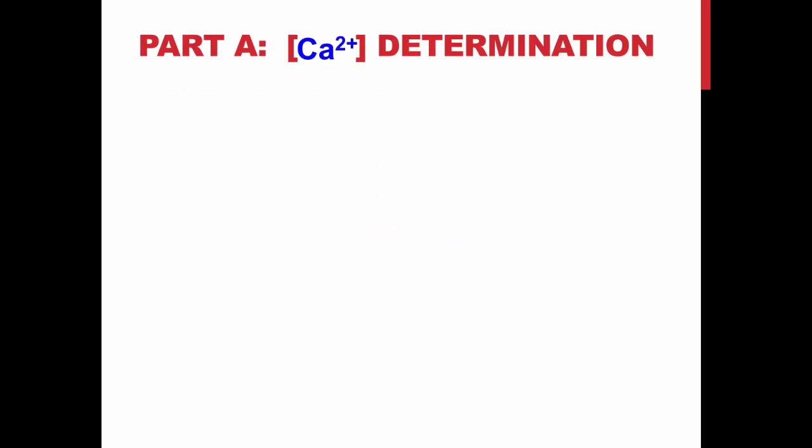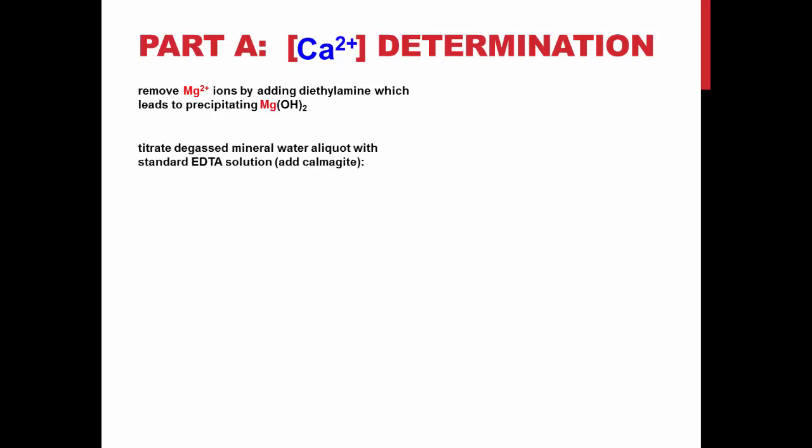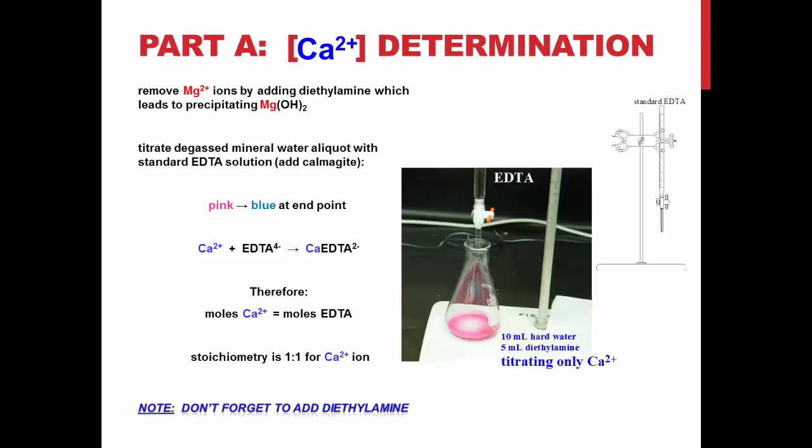Part A, the determination of calcium concentration. Firstly, we will be removing magnesium from the equation by adding diethylamine, which will precipitate out the magnesium in the form of magnesium hydroxide. Then, we will titrate the degassed mineral water with standard EDTA solution. We will be adding the indicator calmagite, which turns from pink to blue at its endpoint. As you can see from this balanced equation, the moles of calcium are equal to the moles of the EDTA, so therefore it has a 1 to 1 stoichiometric ratio. Don't forget to add the diethylamine.